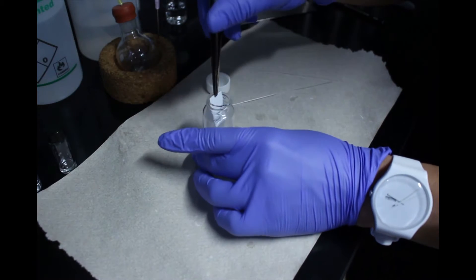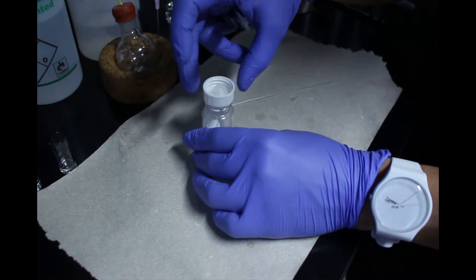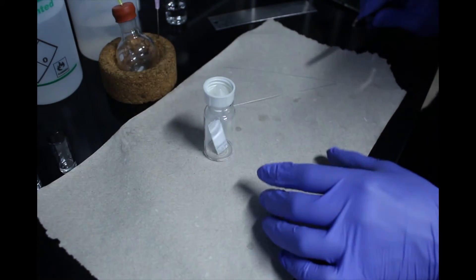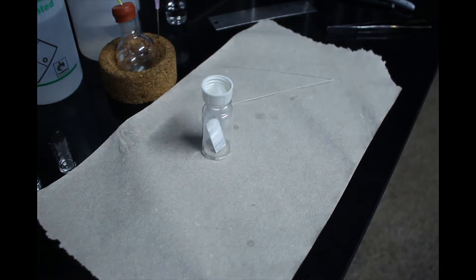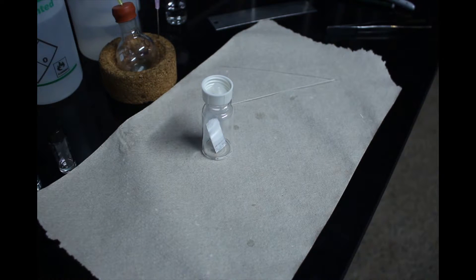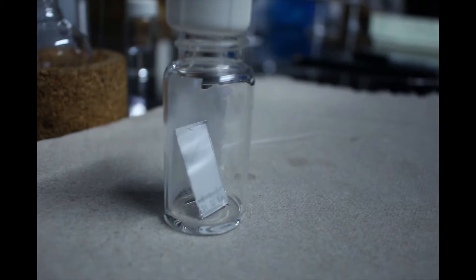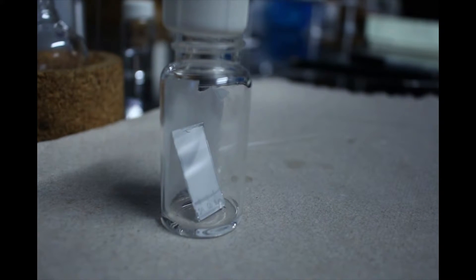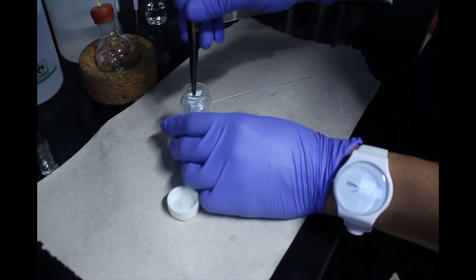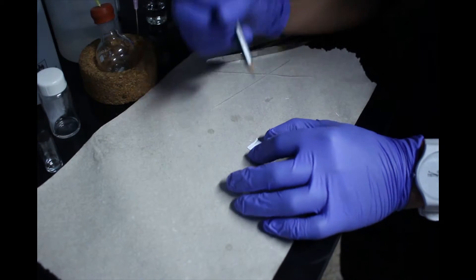With tweezers, carefully place the TLC plate leaning against the wall of your TLC chamber. Replace the cap and do not disturb the chamber as the solvent travels up the plate. Once the solvent has traveled up the plate close to the top, carefully remove the plate and mark the solvent front with a pencil.